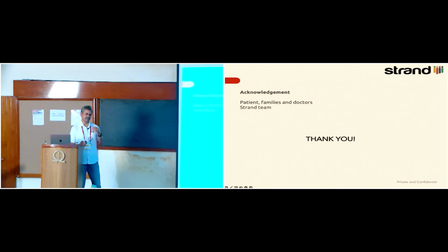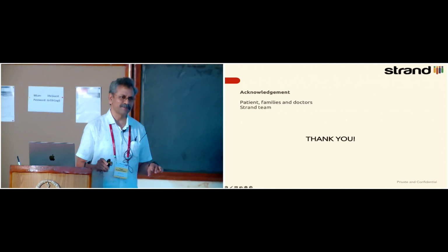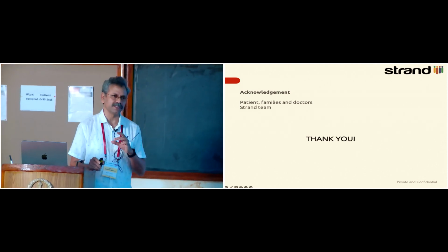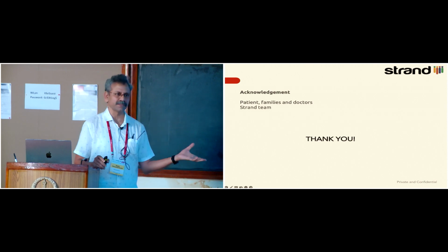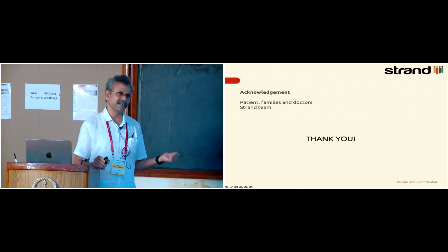So there are two parts to that question. One is we are calling copy numbers only using coverage depth. Those were the missing 4 slides that I skipped over. You can also call out copy numbers using change in the allele frequencies. Yes, a SNP would have a 50% allele frequency. There's 2 copies, but if there are 3 copies, it will become 33% or 66%. We use that in some of our cancer analysis. We don't really need to use it in germline cases because it's fairly clear.